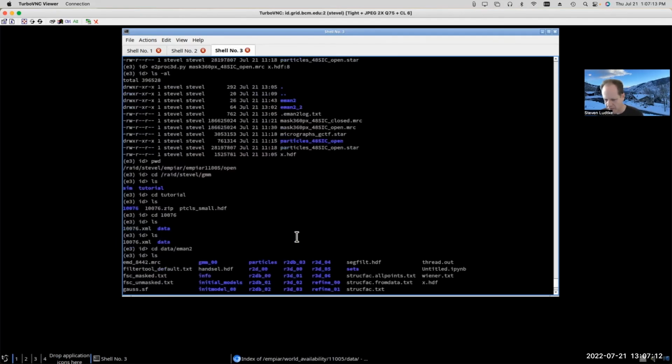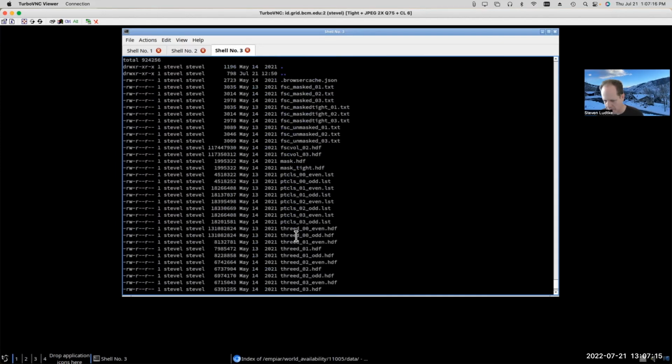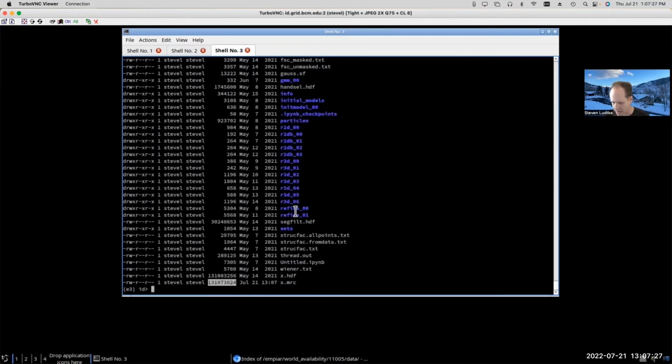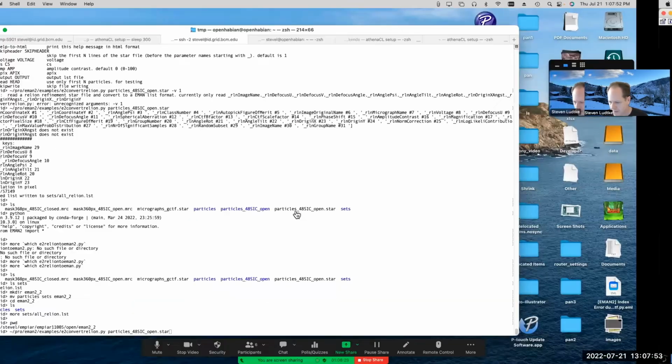So this is actually an extremely useful disk space saving tool, which means that you can basically keep all of these intermediate files that you otherwise might have decided to throw out to preserve disk space. And if you email that to someone and they say, oh, I don't have EMAN to look at it, I want to look at it in something else, well, Chimera can directly read the HDF file, so you wouldn't have to convert it for that. And if you need to convert it back to MRC, as long as they have EMAN2 installed on the machine, they can just run e2proc3d and convert it back to an MRC on the other end.